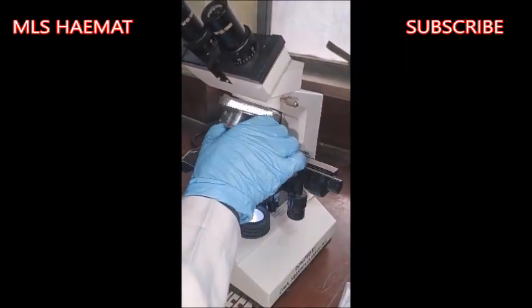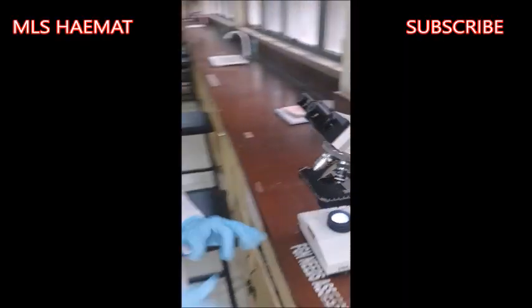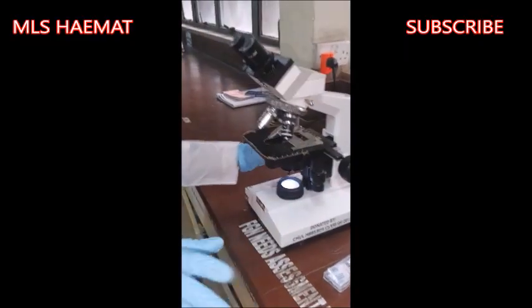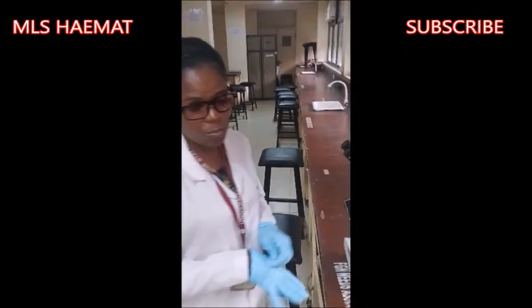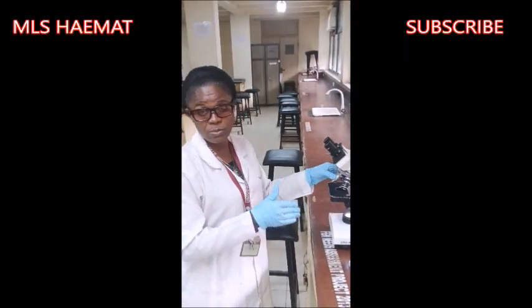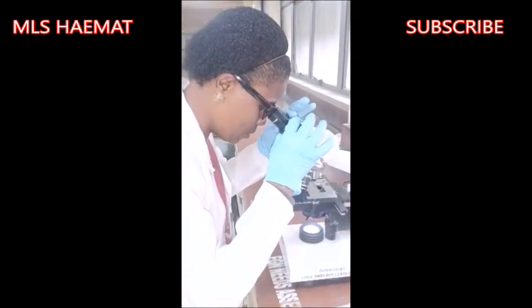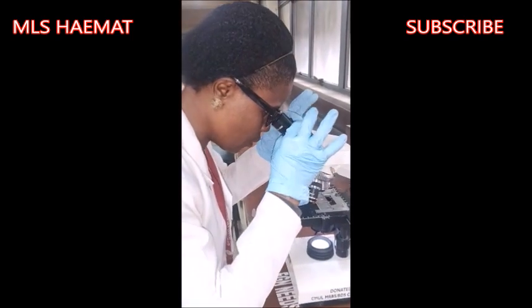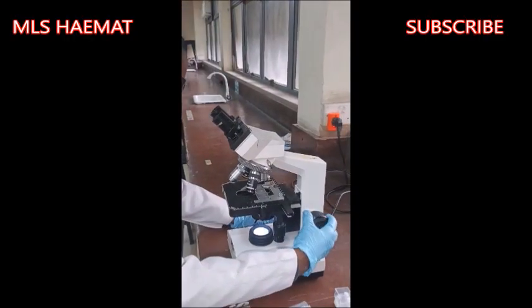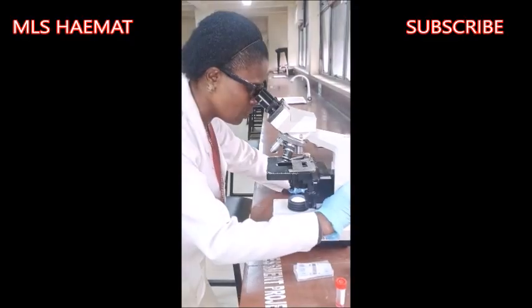Remember when we talked about the different parts of the microscope. The ×4 objective lens is a scanning objective lens, as we said before. In order for you to view any sample, you can place it on the stage and then put the ×4 objective lens in view. Look into the eyepiece. Use the diopter adjuster to adjust the eyepiece, and then what you need to do afterward is to raise the coarse adjustment up.